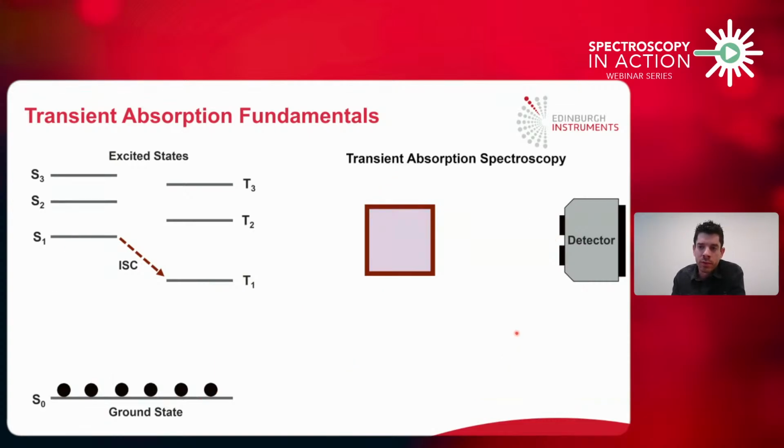So as we discussed before, one issue with photoluminescence is that the excited states can relax to the ground state non-radiatively. So if it happens, then transient absorption is the alternative technique to detect and study these excited states. And note that we compare probe absorption versus pump and probe absorption, the excited state. So let's look at what happens in a pump probe setup.